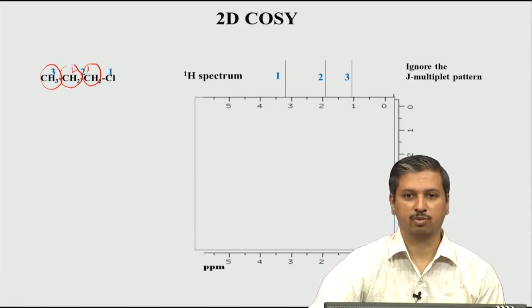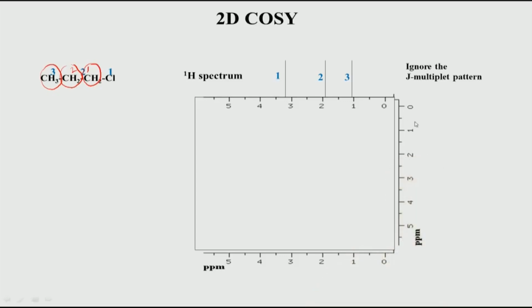Now let us come to the 2D here. So, I get a 2-dimensional plane. So, this is a 2D NMR. I am recording a 2D of this spectrum. You will have one axis which is the T1 axis, that is all proton, and this is also proton. So, we are looking at 2D COSY, which is a homonuclear correlation experiment. That means both dimensions will be hydrogens, protons.